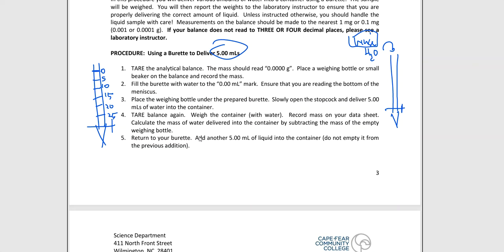In the second time and the third time, what normally happens is that I will open up the stopcock, and I will allow that liquid to drain through the stopcock as well, because the stopcock could actually be dirty, and the tip of the burette can actually be dirty as well. That needs a good rinsing. So I want to make sure that I come in contact with every part of the burette that my sample will come in contact with, or my titrant will come in contact with, so that way I know all of the crud or the contamination is now gone, because I've rinsed it a few times and I've made sure of that. So that's going to be the first thing that you got to do.